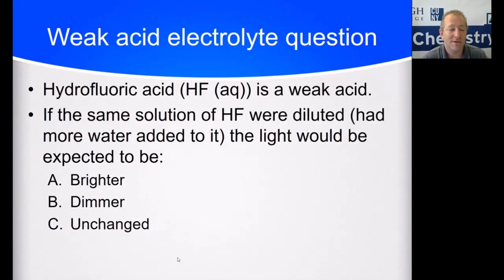Based on your answer, is the light going to get brighter? Is it going to get dimmer? Or is it going to remain unchanged if you dilute moderately a solution of HF?